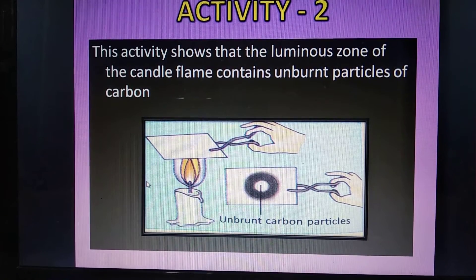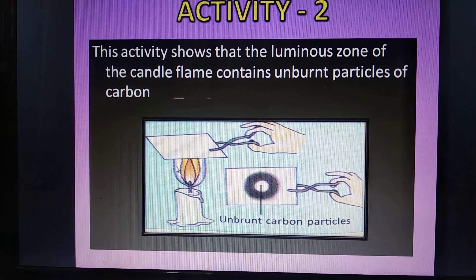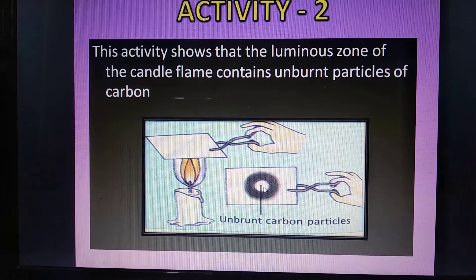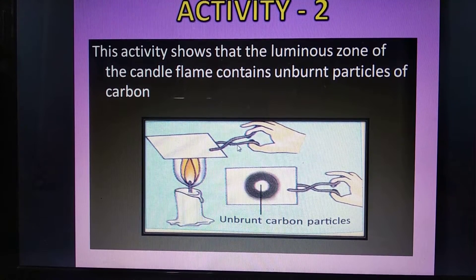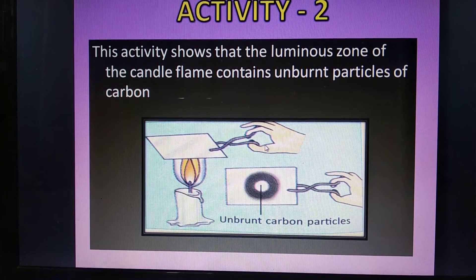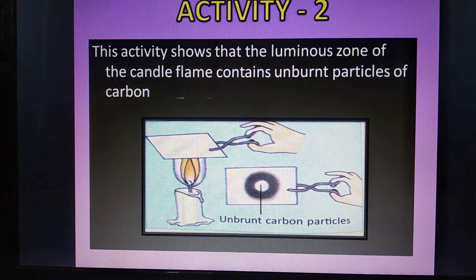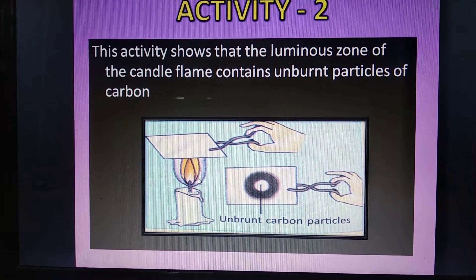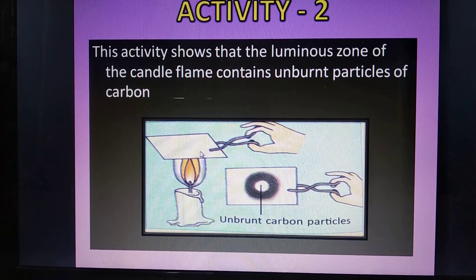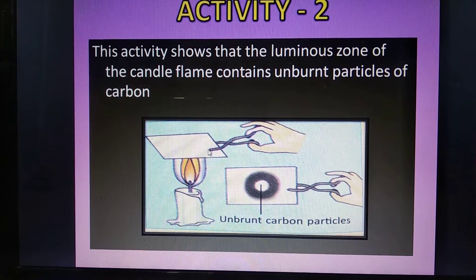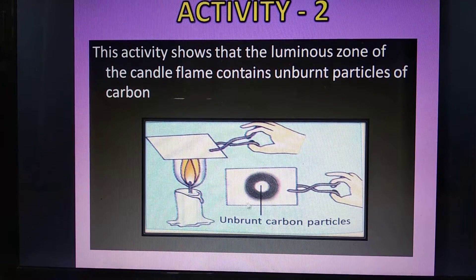The next activity is to show that the middle zone of candle flame consists of unburnt carbon particles. Light a candle, hold a clean glass plate with the help of a pair of tongs and introduce it in the middle zone or the luminous zone of the candle flame. Hold the glass plate in this position for about 10 seconds. Then remove the glass plate from the candle flame and observe it carefully.